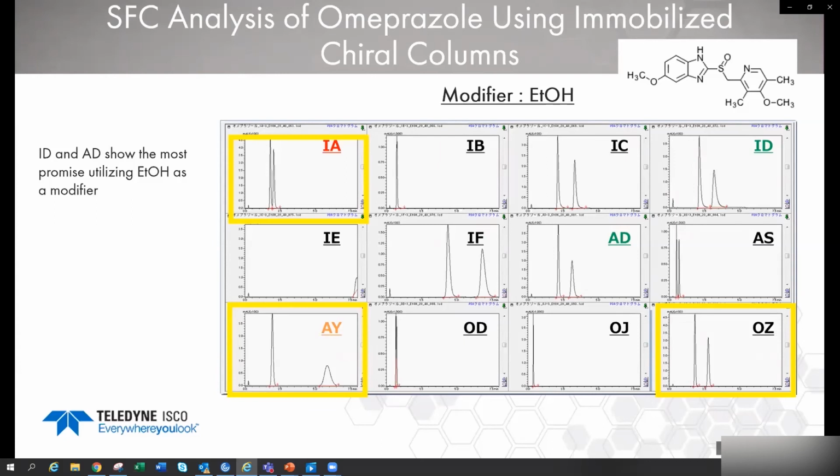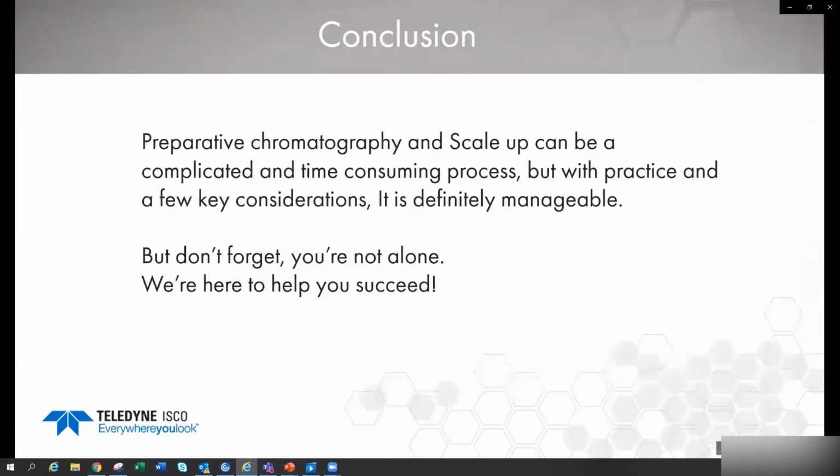It's basically a trial and error with modification of modifiers, phases, and pressures. If you'll notice the OZ over here, the other one that I had highlighted, it's actually pretty much the same between both chromatograms. So we're coming close to the end of our time.